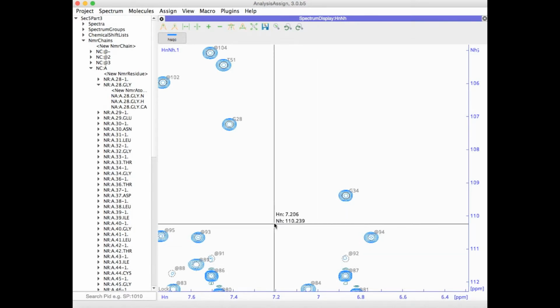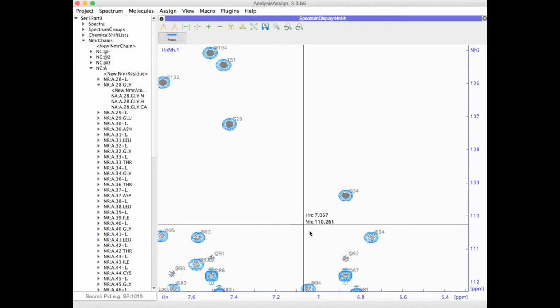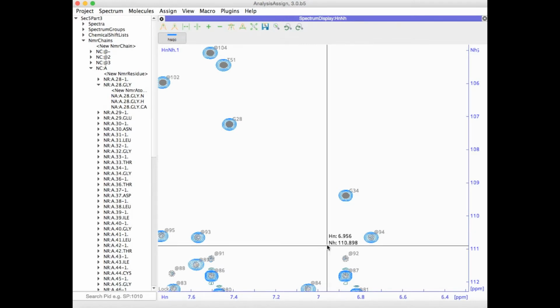The next option then is a filled line width option. Again, it's filled where the line width has been determined. Where it hasn't, you get this kind of flower symbol. And then finally, you can show your peak symbols as plus signs.